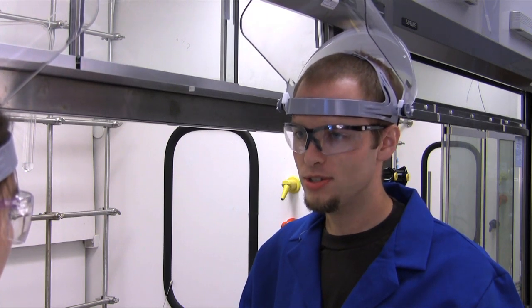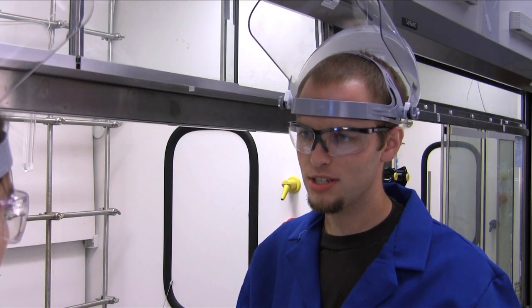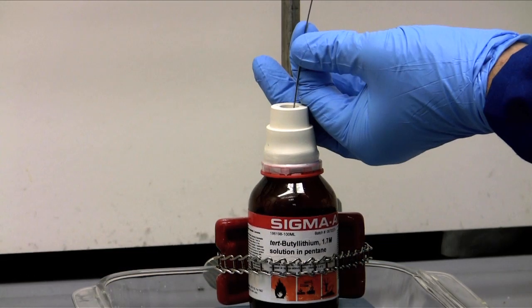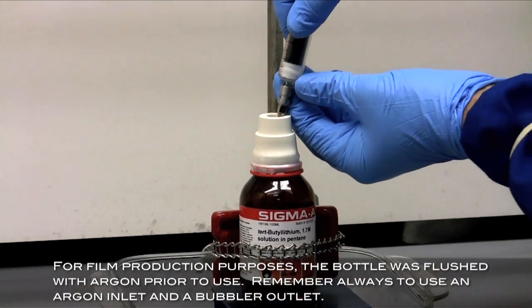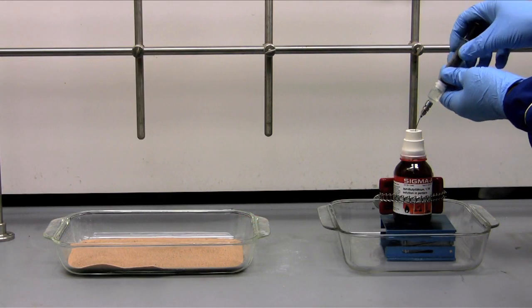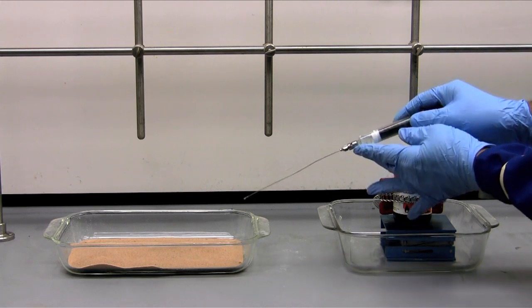Now, let me show you just how reactive tert-butyllithium is. I've already got the bottle restrained and in a secondary container. Tert-butyllithium will ignite spontaneously in air as it reacts with oxygen and moisture.